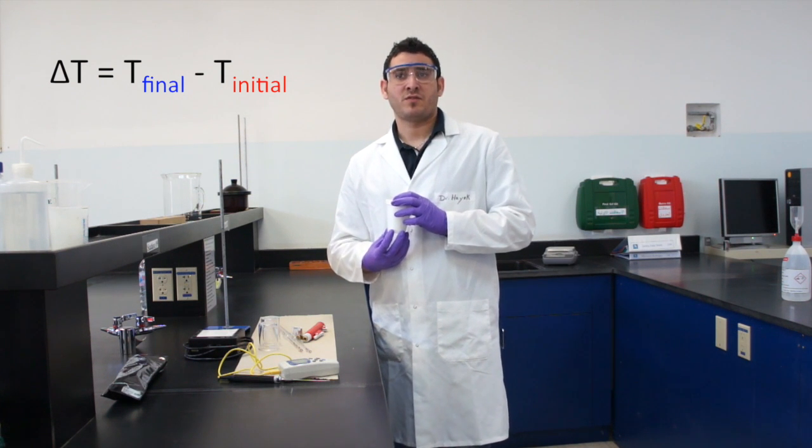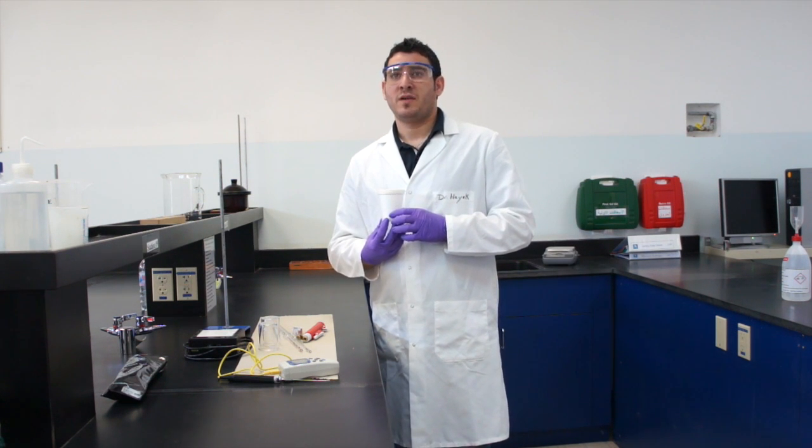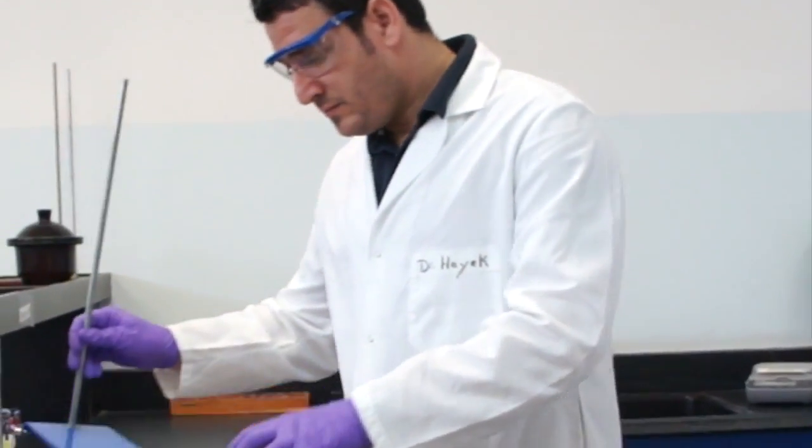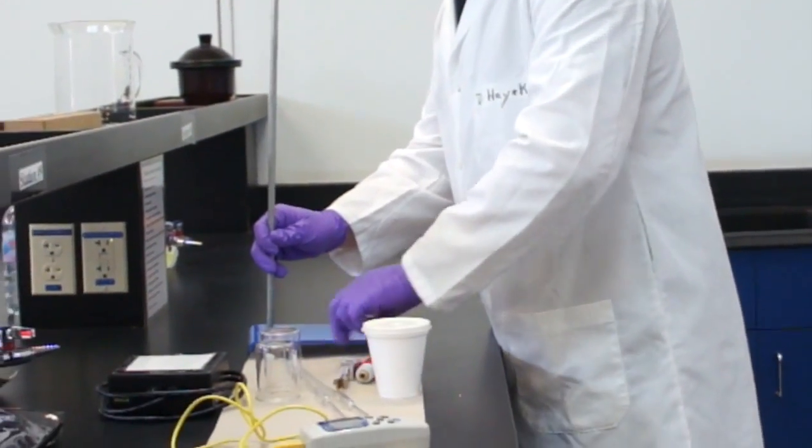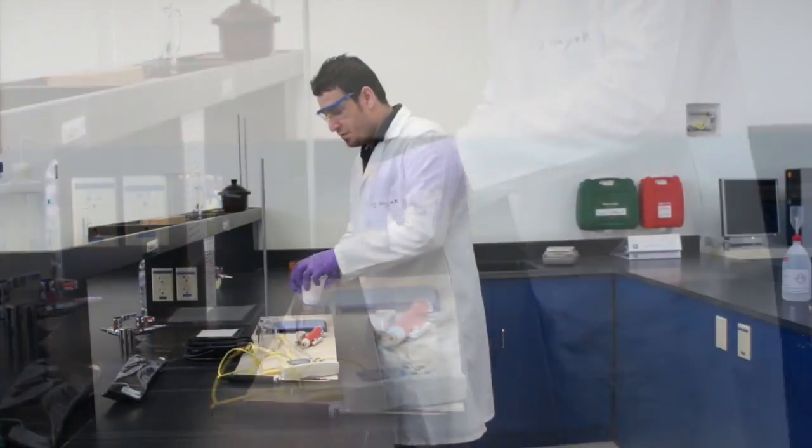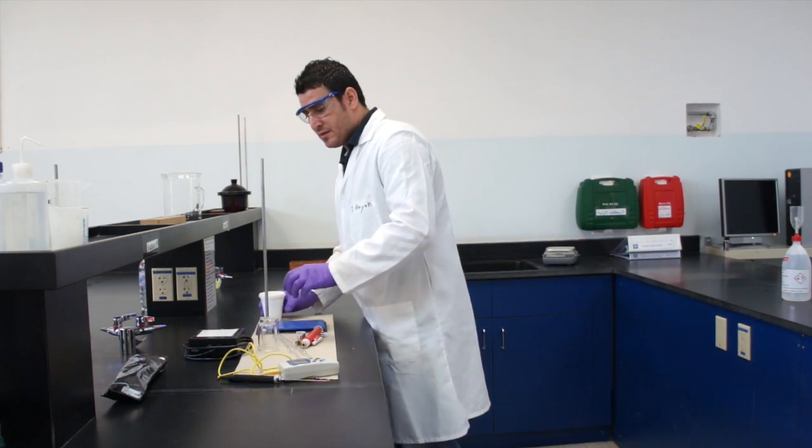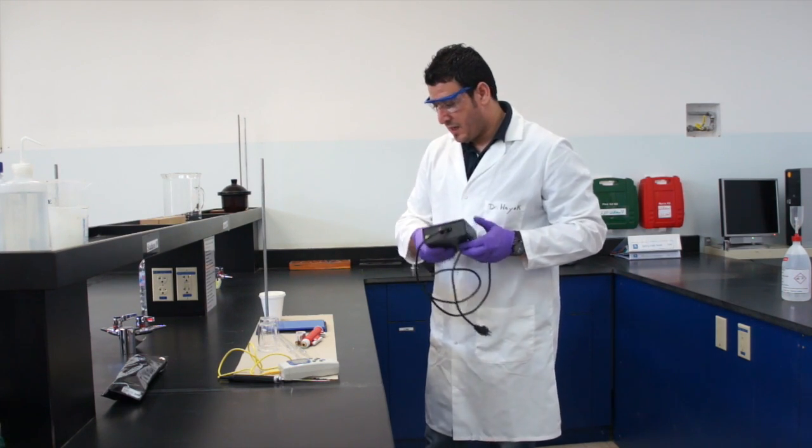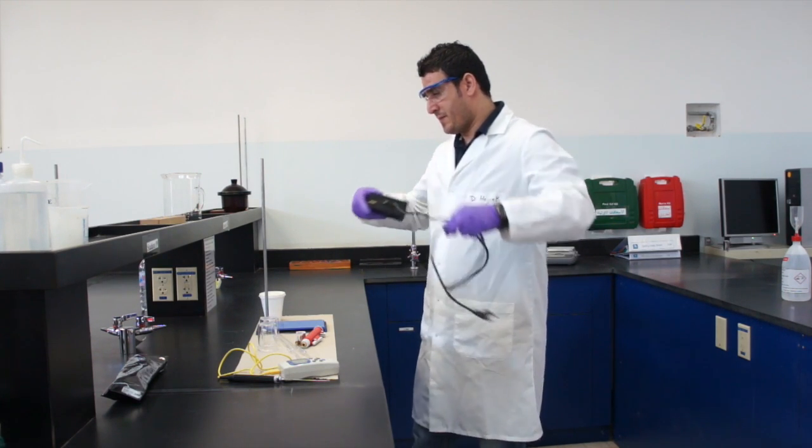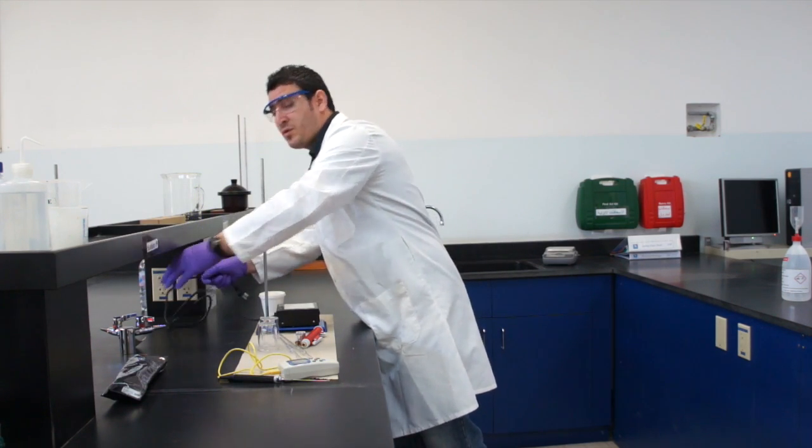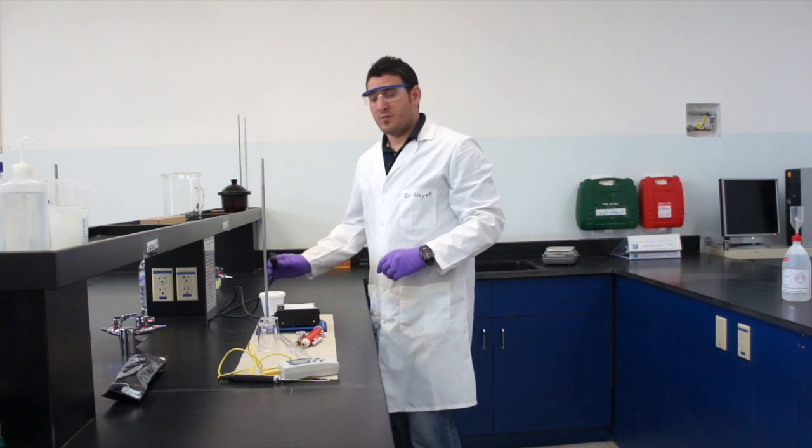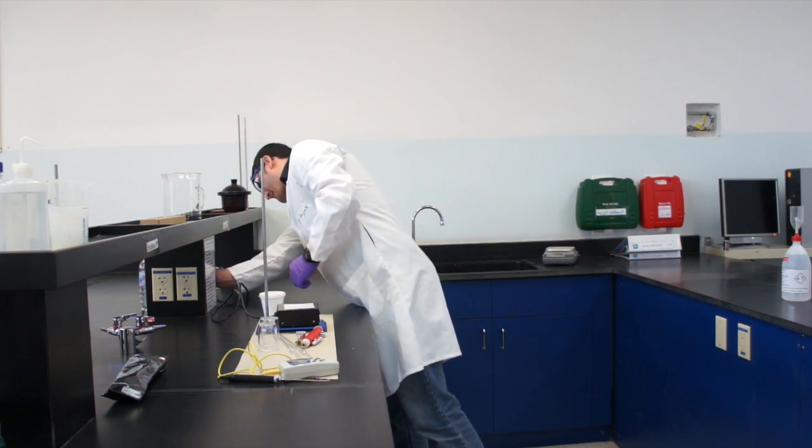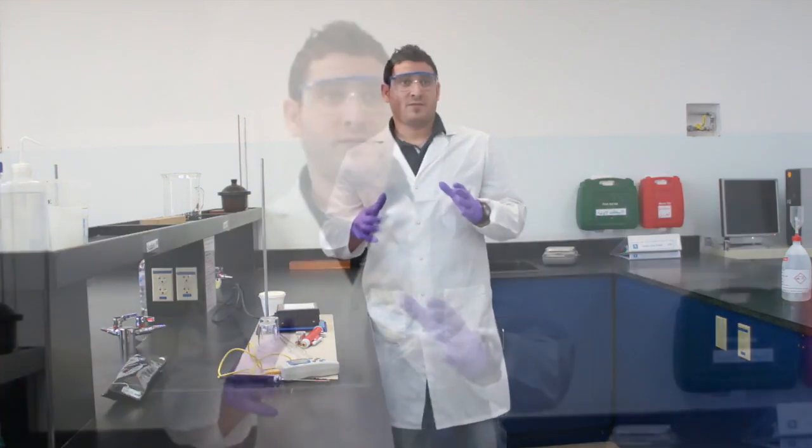What I have to determine experimentally is delta T. So all I need to do is measure the temperature of the solution before mixing and after mixing. I will put the base first—it doesn't matter which one we put first, but we will proceed by putting the base.